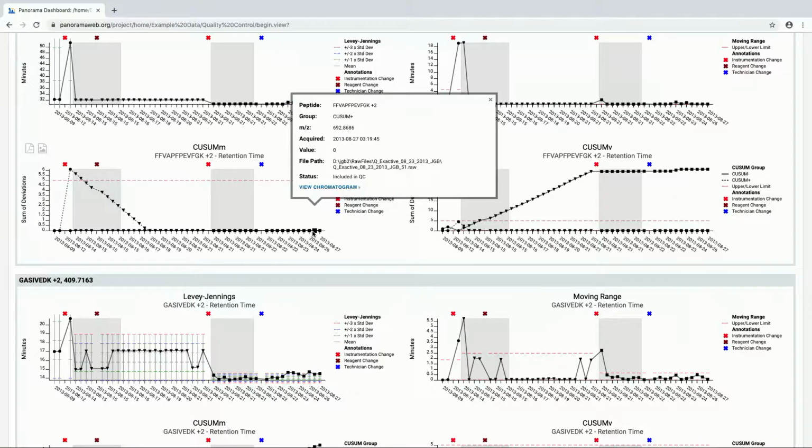Mm-hmm. Is this chart available across LabKey in all instances? Yeah. So I don't have that set up for demo here, but yes, that's the QC trend report that I mentioned. So that's a premium feature where it's most easily attached to an assay. There'll be a menu option up on the top to create one, and essentially what you need to do is point it at whatever the value is that you want to be monitoring.